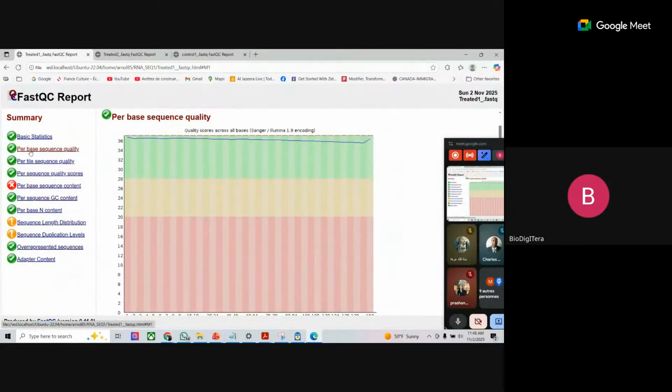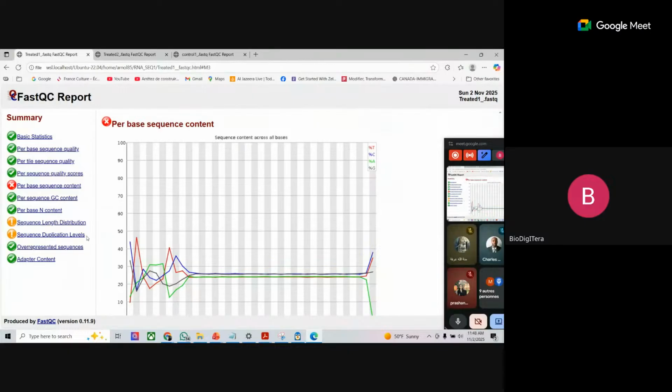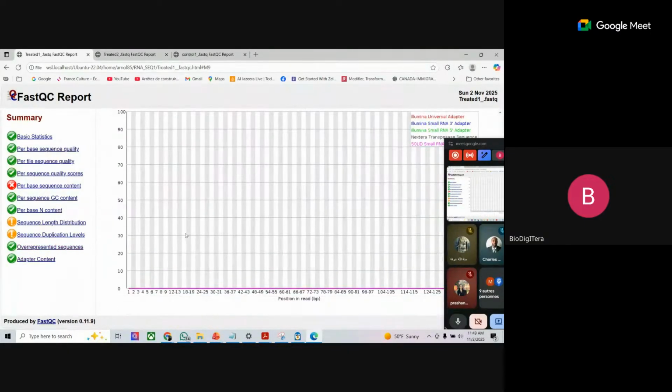That, because I told you that this one is the sequence base quality. The sequence quality is the consequence of base sequence quality. So if this one is already bad, normally this one will not be great. Okay. Now I will go to the overrepresented. So I am just explaining the key parameters. The other part I will give you as assignment.